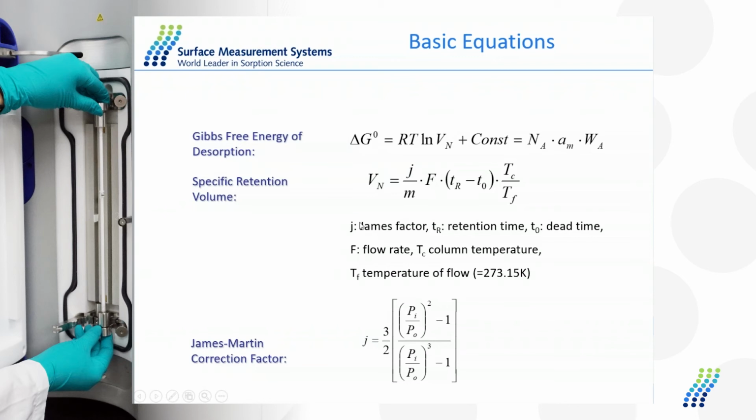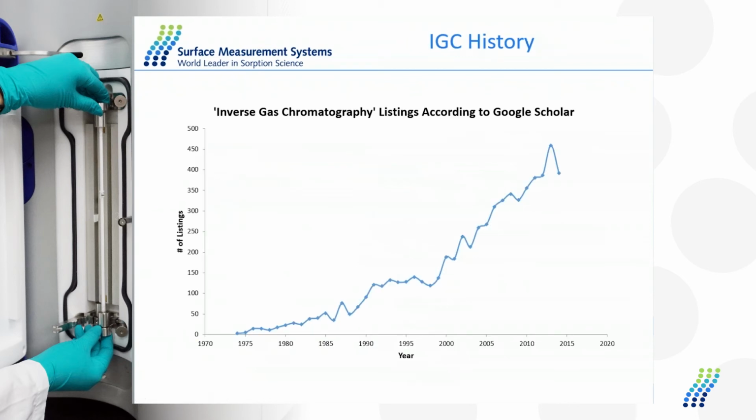Just to give some historical perspective of inverse gas chromatography, it is a technique that SMS did not invent, but we pioneered the commercial development of this product in the late 1990s. This is just showing basically a histogram of the number of listings in a Google Scholar search of the term inverse gas chromatography, with the number of publications by year.